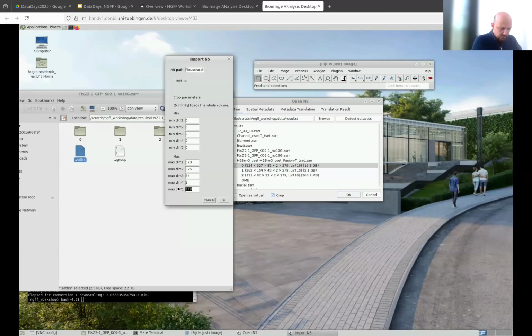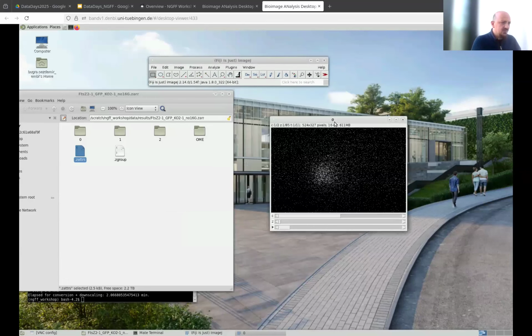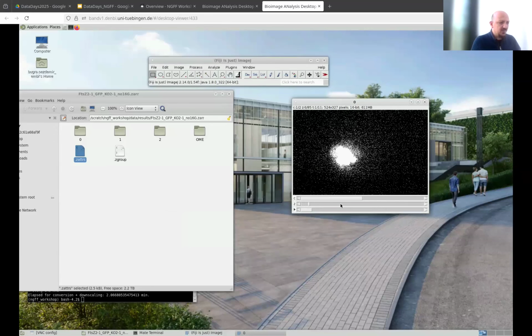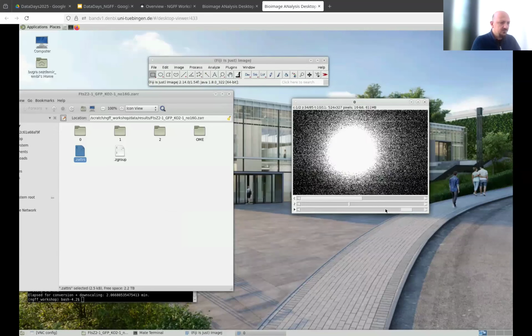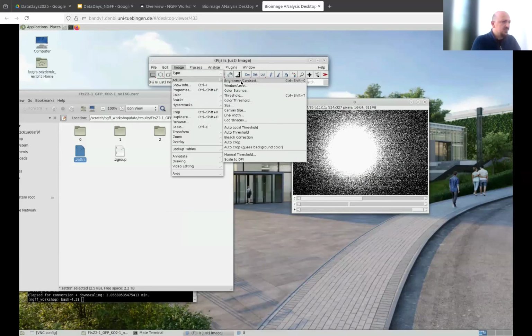So this is actually the time. Let's say I just want to open the first 10 time frames. I can do this, and if you want, you can also specify other axes. Then I click OK. And then you see this is the full resolution image, but only the first 10 time frames. So this is basically some of the things that you can do when you are reading OME-Zarrs into Fiji.